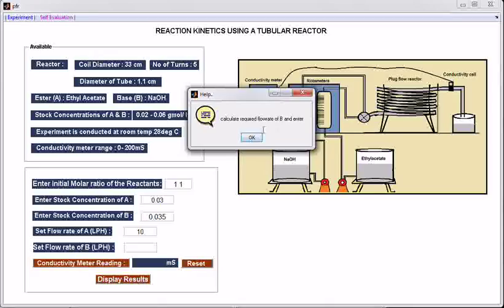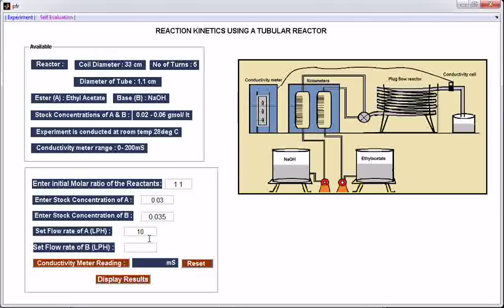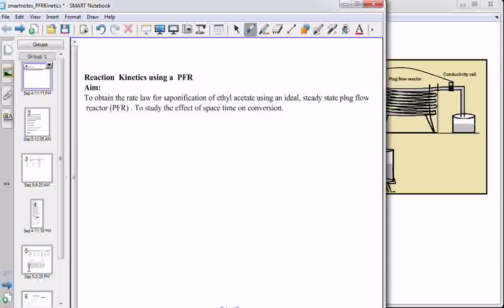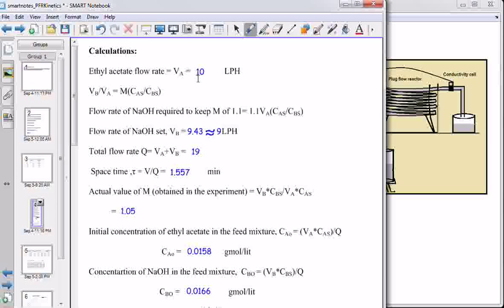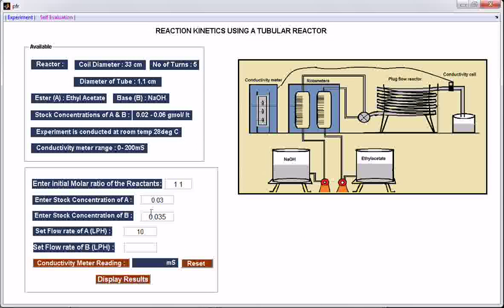Calculate the required flow rate of B and enter. For this flow rate of ethyl acetate, to maintain a 1.1 molar ratio of the reactants, I will show the calculations for the flow rate of sodium hydroxide. Let us take the rounded-off value — enter 9 — and click the button for the conductivity meter reading. This is the conductivity meter reading for this flow rate of ethyl acetate. To set another flow rate, click reset and enter another flow rate, like 25 lph.